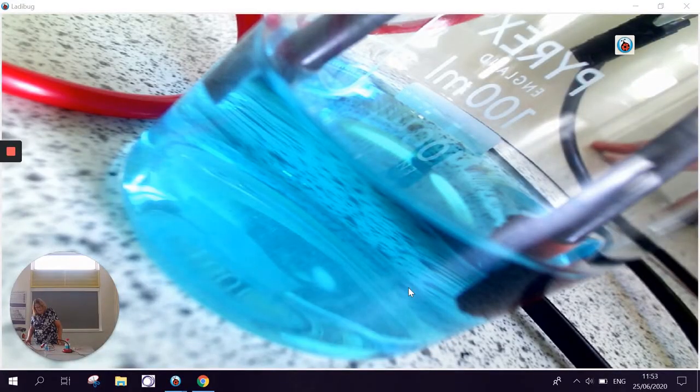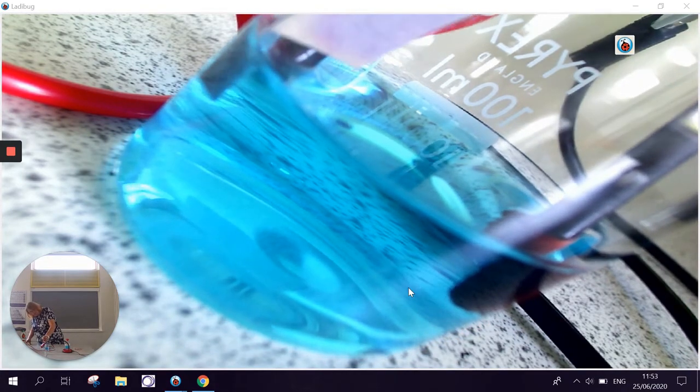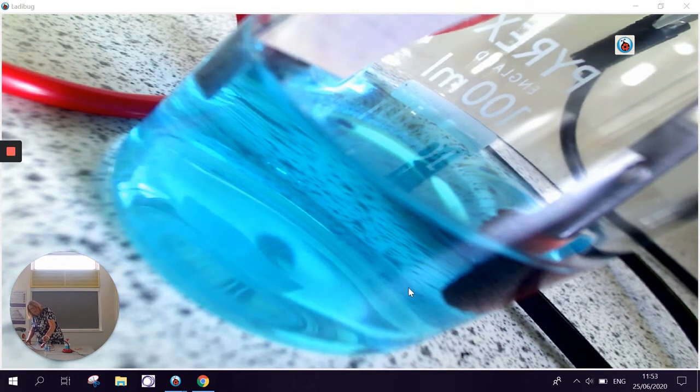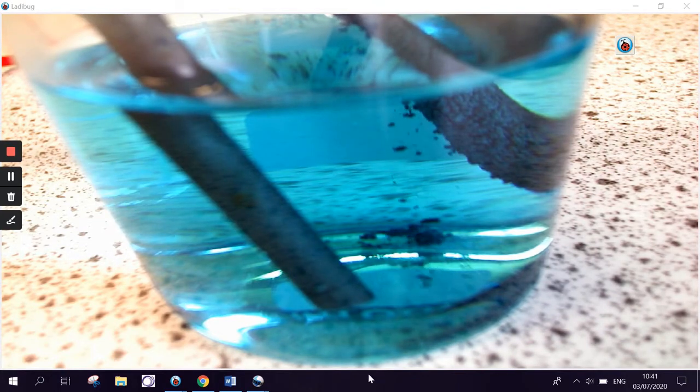You can clearly see that at the positive electrode — that's the one on the right — there are some bubbles forming. I'm going to test that gas with some damp litmus paper, and if I hold it close to where the bubbles are being released, that damp litmus should end up being bleached. You can just see that happening — that's a positive test for chlorine. At the positive electrode, the negative chloride ions discharge electrons, become chlorine atoms, and then covalently bond to form chlorine gas molecules.